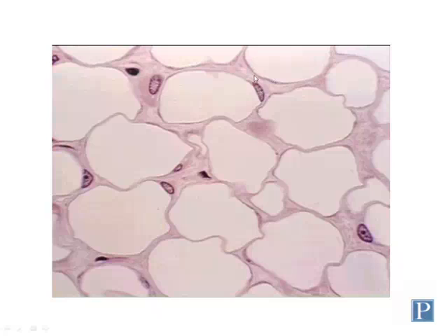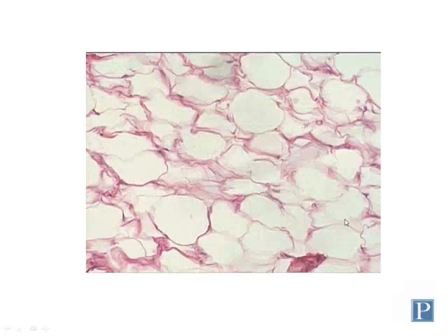When stained with H&E, you can actually see some more details, like the nuclei on these cells here. You may see some fibroblasts in the extracellular spaces or between the cells, in addition to the collagen fibers, which are these eosinophilic fibers. Now, some of your sections may have more of an appearance just like this when stained with H&E, and it really just depends on the quality of the slide, how it's been prepared and mounted.